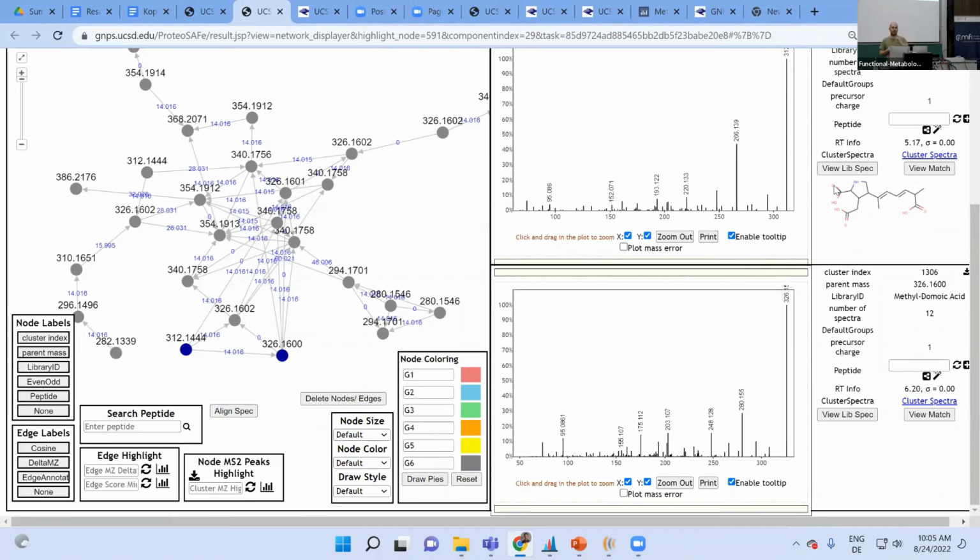And I would definitely look now at the XICs of those and check whether they were actually well-defined features, right? I can nicely see them where they're separated peaks in the chromatogram, or was that some sort of artifact? So that's really when you need to go back to the chromatograms too. I'm not going to do this right now, but there's an easy way to do that from GNPS, or if you still have your MZmine project open, obviously you can go back there, or use Qual Browser or whatever other visualization tool you have.